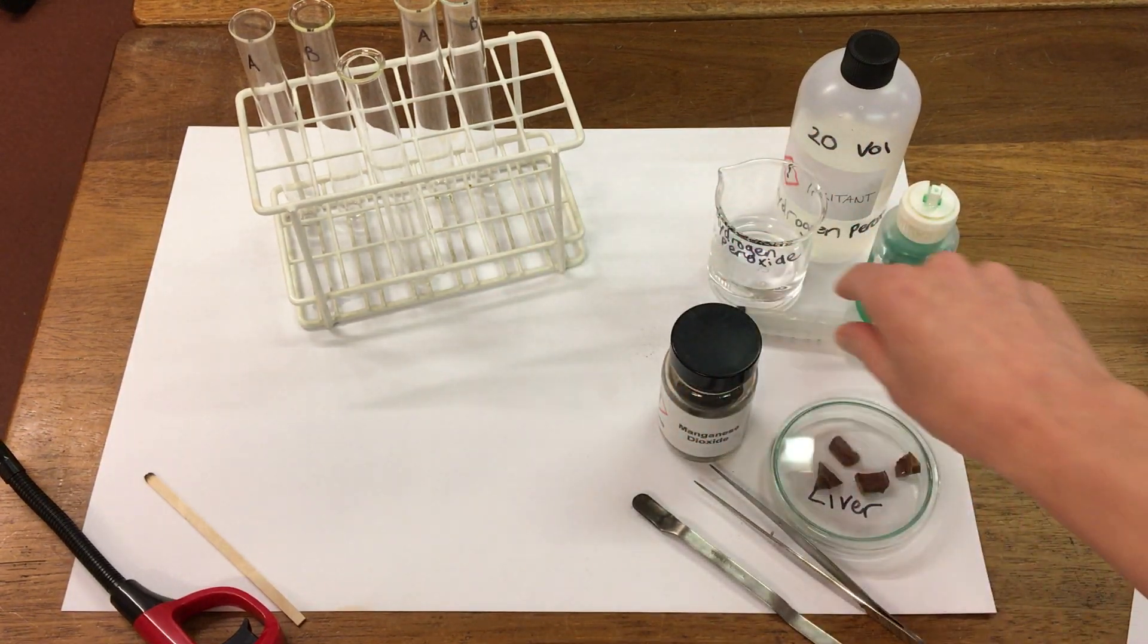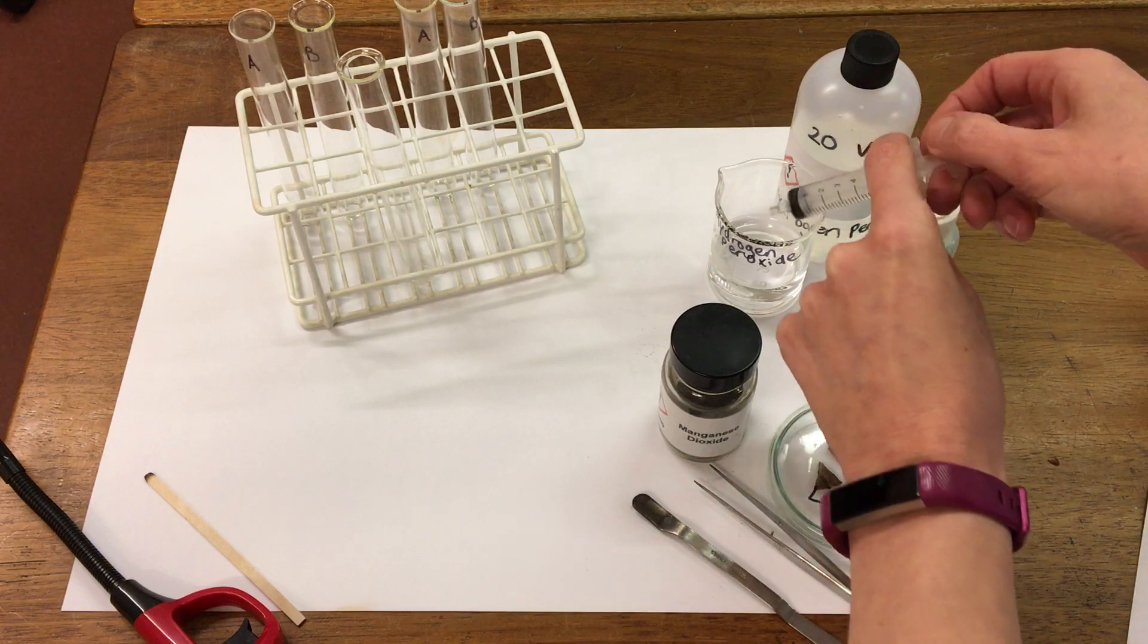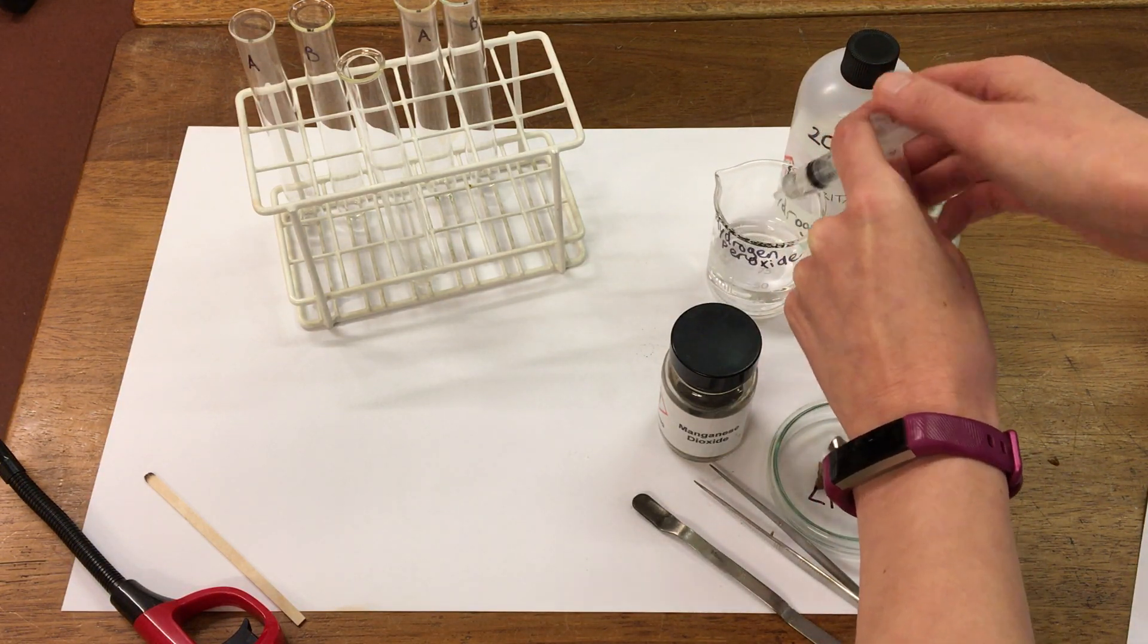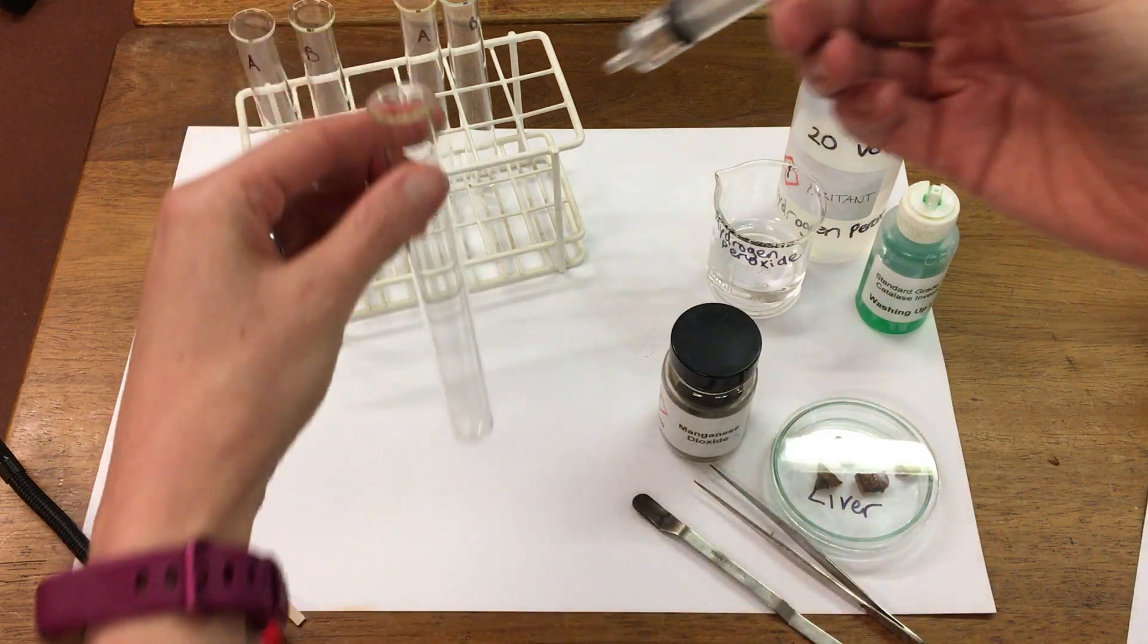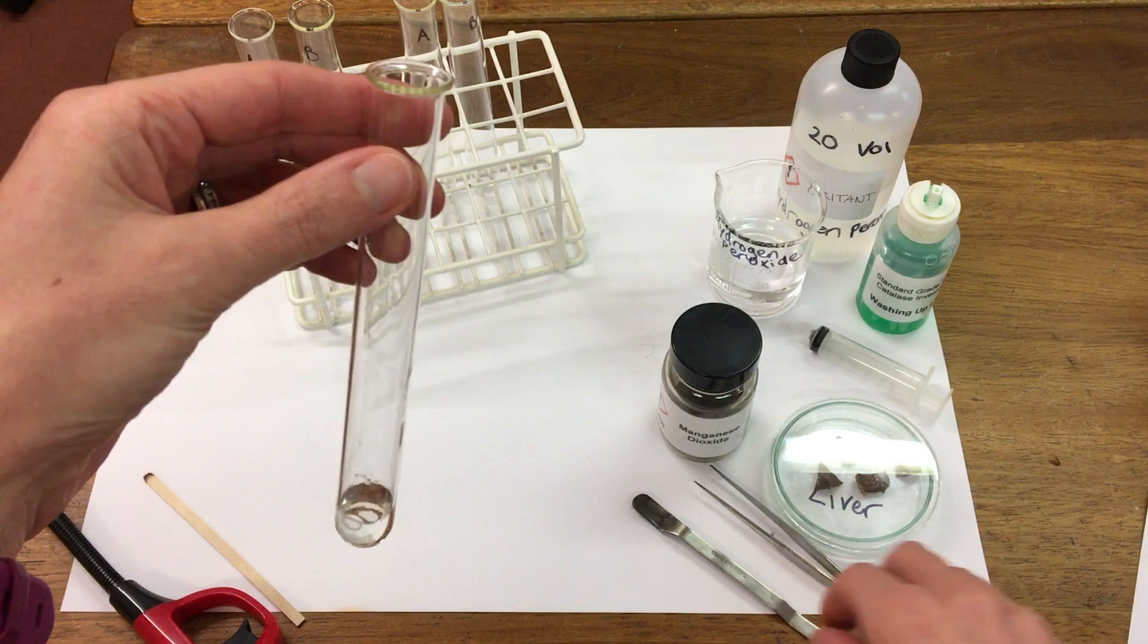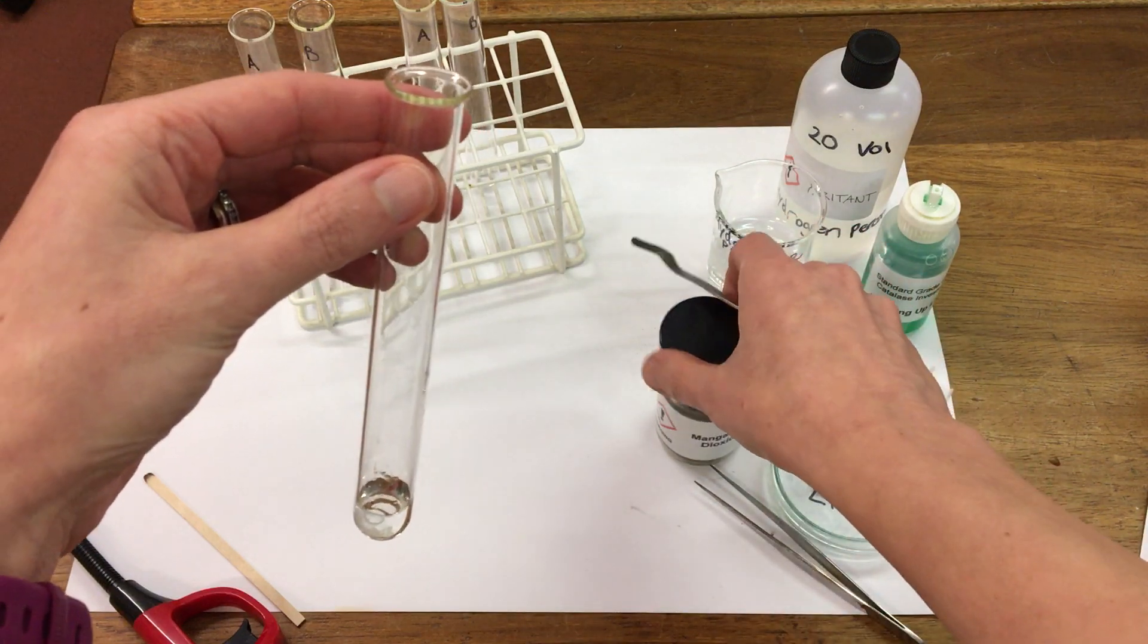So first of all I'm going to take two mils of hydrogen peroxide and we're going to add it to a test tube. I'm then going to add a spoonful of our catalyst.